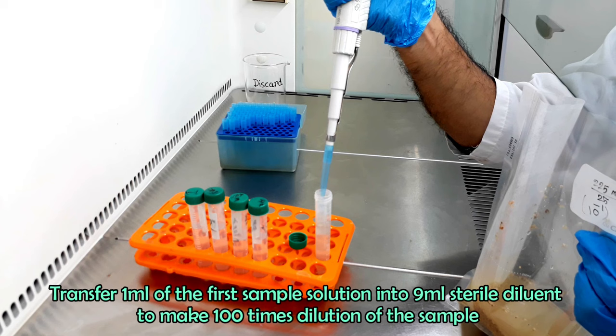These are the media and diluent control plates. There is no colony formed in media and diluent control plates. Hence, we can say that there was no contamination occurred in culture media and in diluent.